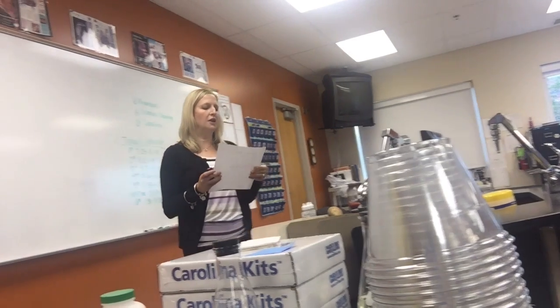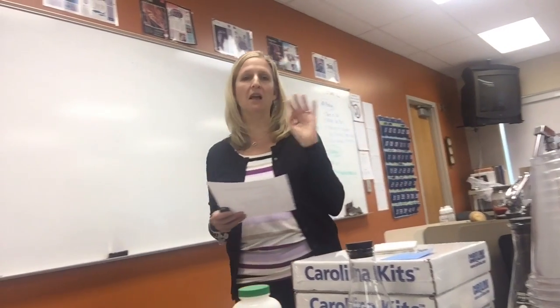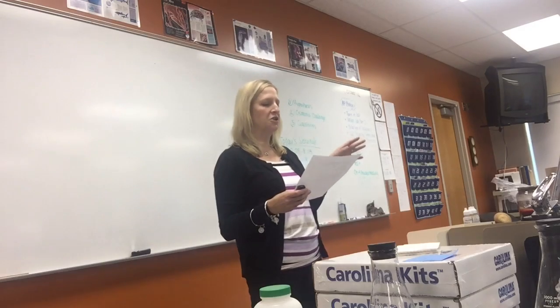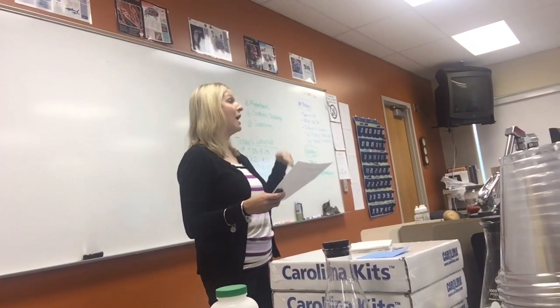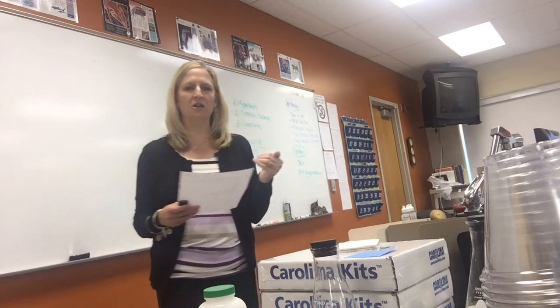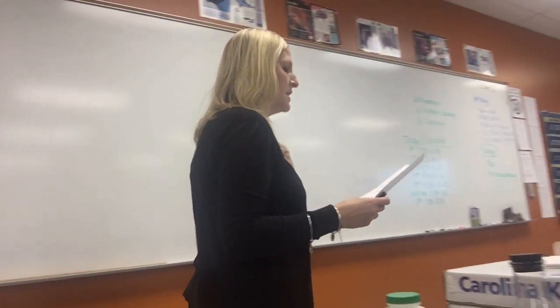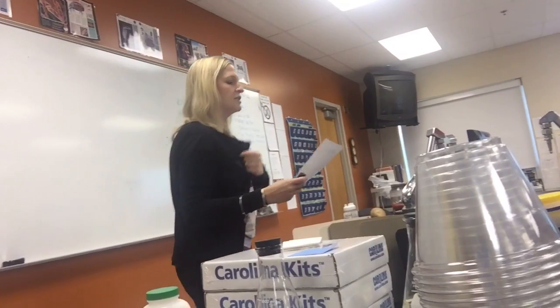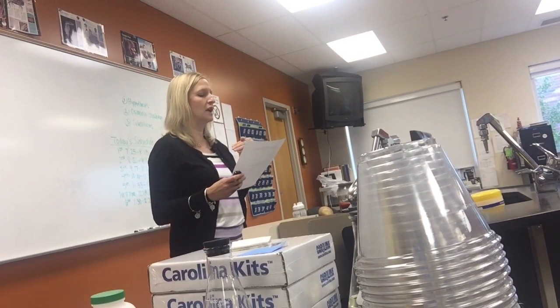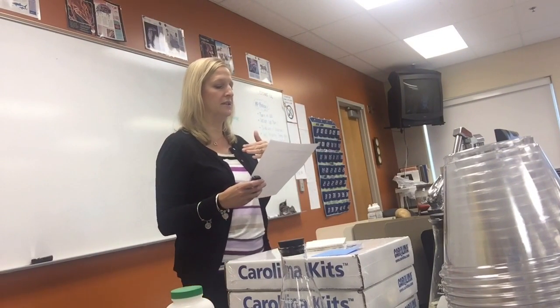So if you look at this sheet where it says the following materials are available to you, I'm telling you what you have available to design your experiment to figure out what the molarity of the potato cells are. Notice there it says beakers. Actually, instead of using beakers, I have a bunch of plastic cups here. We're going to use cups instead of beakers. You're going to have distilled water at your disposal, and then different molar concentrations of sucrose, so 0.2 through 1.0 molar sucrose solutions.